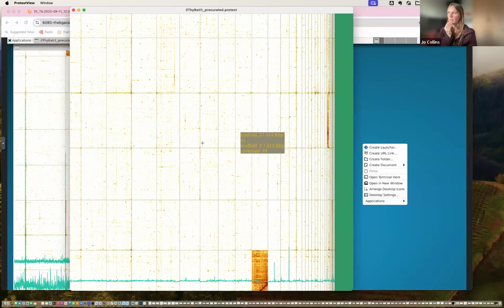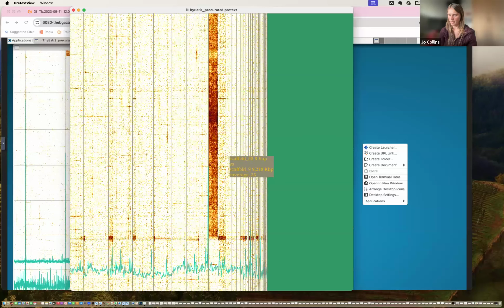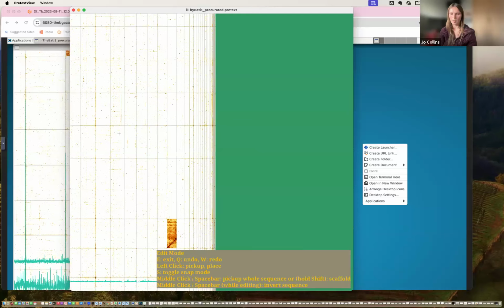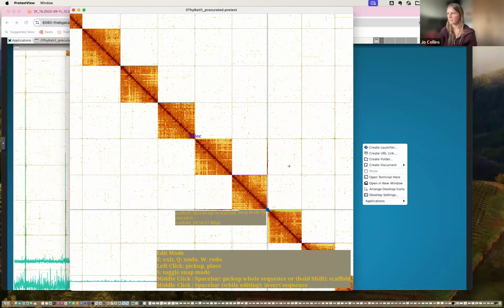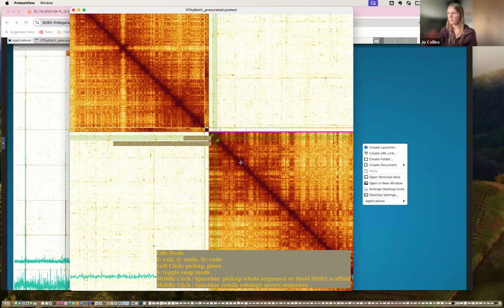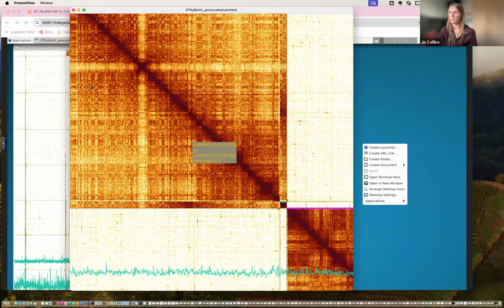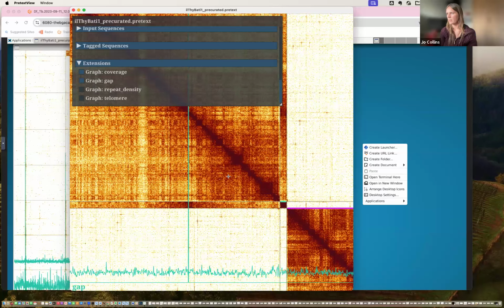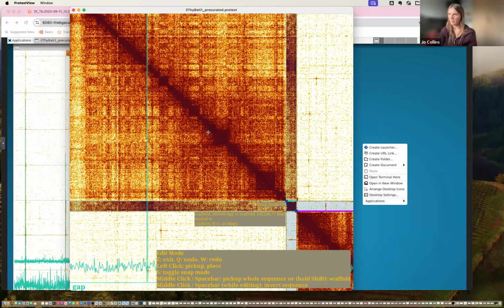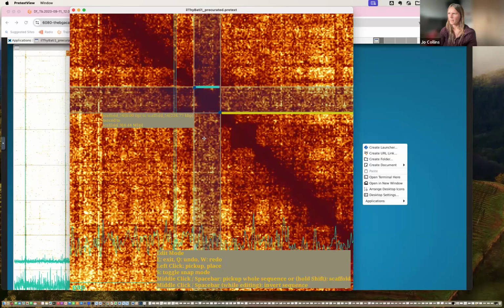And we're going to look here, and again, we've got another piece here. So pick that up and drag it across, and park it to the right of the chromosome. In this case, I'll turn my gaps back on. You can see again that the strongest contact here is where this gap is. So we're going to maneuver it into the right location.